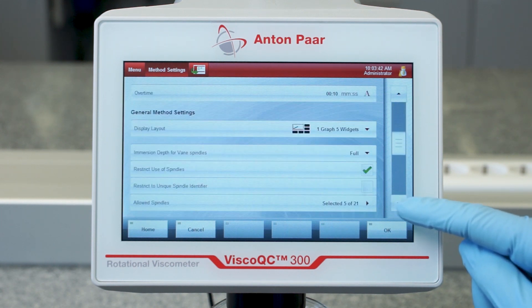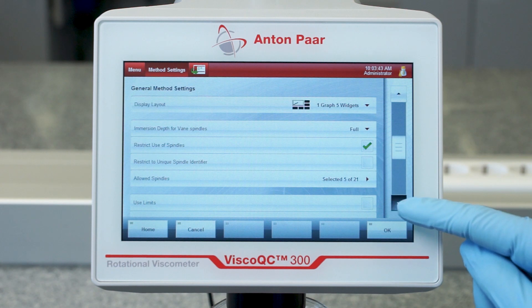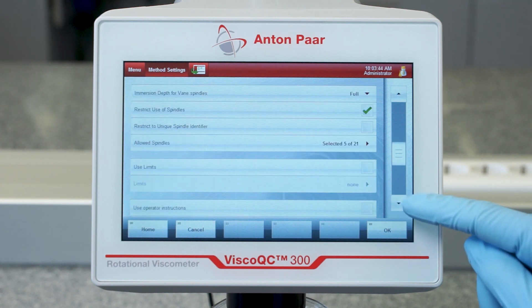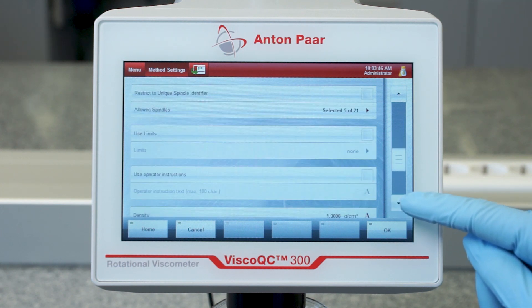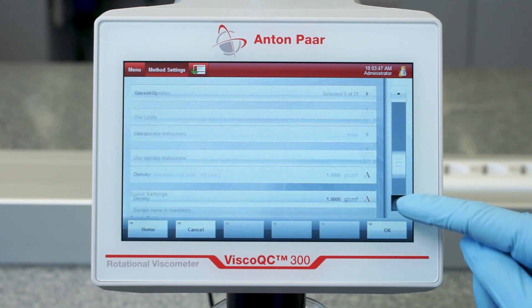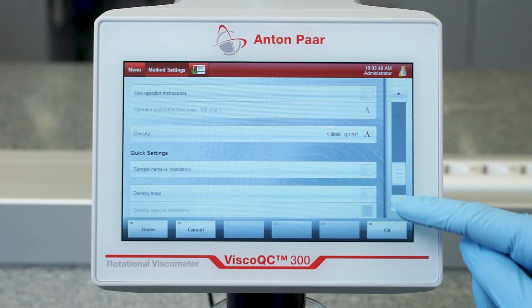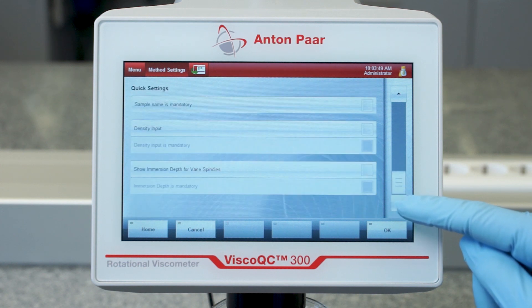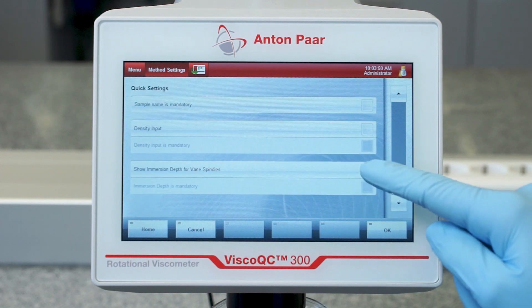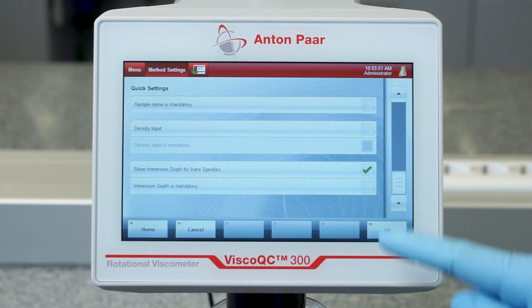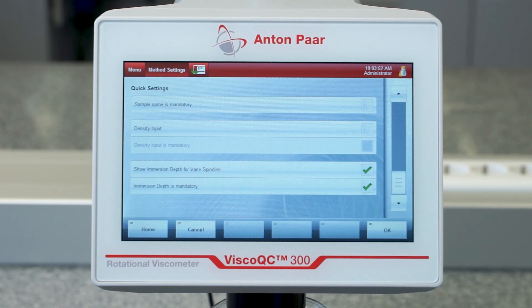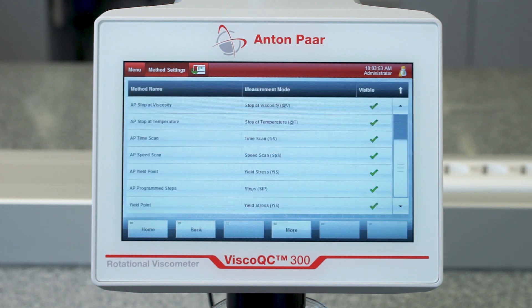For vane spindles number 71 through 73, two immersion depths are possible. Therefore, it is recommended to set the immersion depth as a mandatory quick setting. Tap OK when you are finished to save the method.